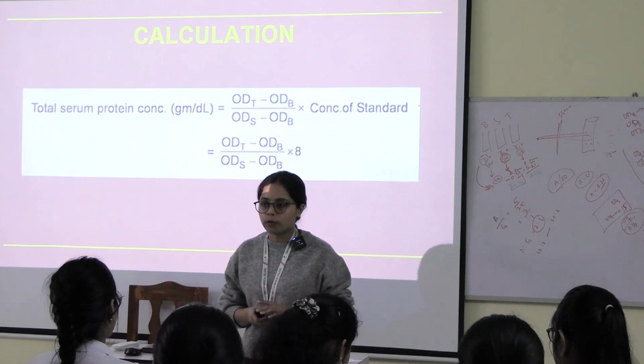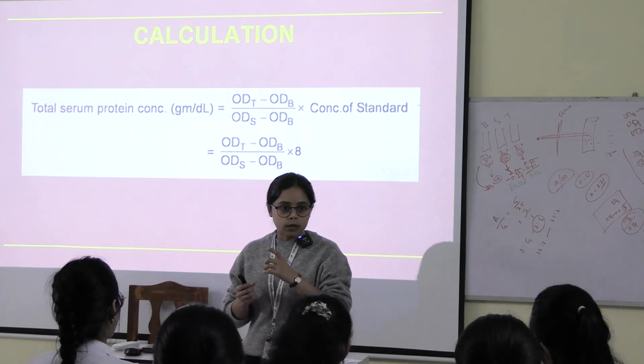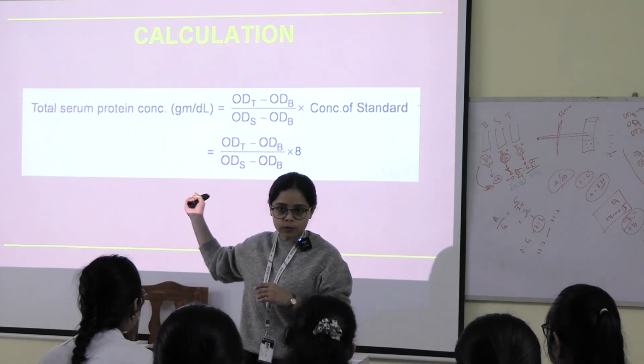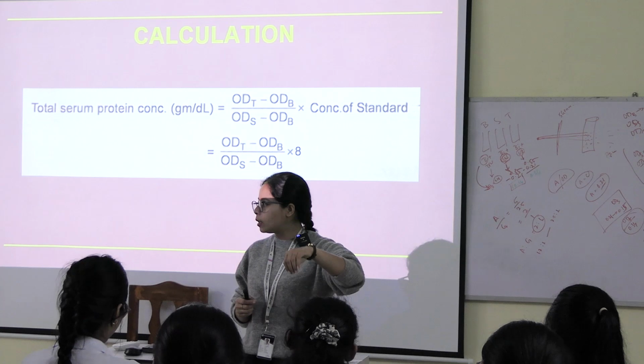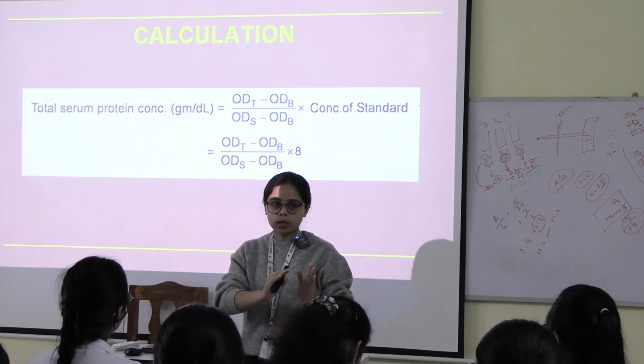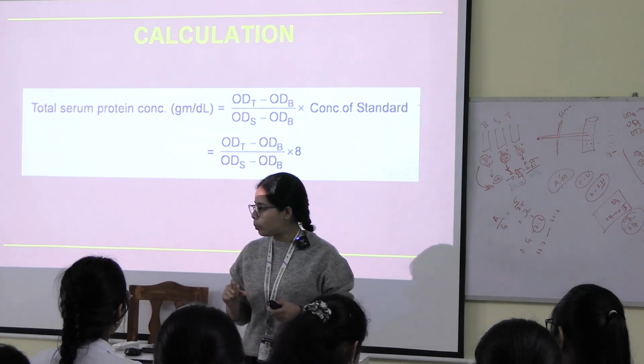The colorimeter will do it for you. You will take the standard, you will take the distilled water, that is more than 3 ml distilled water, like you took in this formula, you will put it in the colorimeter, you will bring it to 0 for optimum calibration. You did it. After that, next you have to take the blank, right?